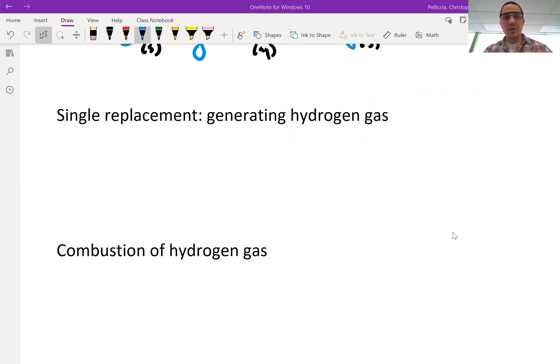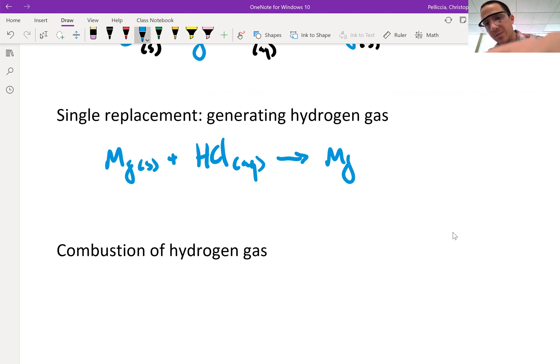In that first example, generating hydrogen gas, I took a sample of solid magnesium metal and added it to a solution of hydrochloric acid. And that generated the products magnesium chloride and hydrogen gas. That reaction needs to be balanced. The two right there.